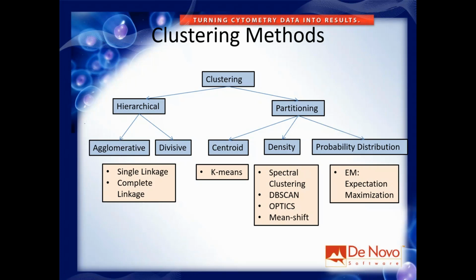So the unsupervised method you're handed in this talk by some fancy pants mathematician is really a very constrained, very supervised, very rigid approach that will get you a very particular answer that may or may not be appropriate for your data. That's why it's unfortunately important to understand at least the basic principles of how these work, so you can evaluate whether this quote unquote unsupervised approach is actually useful for you and your experiments.